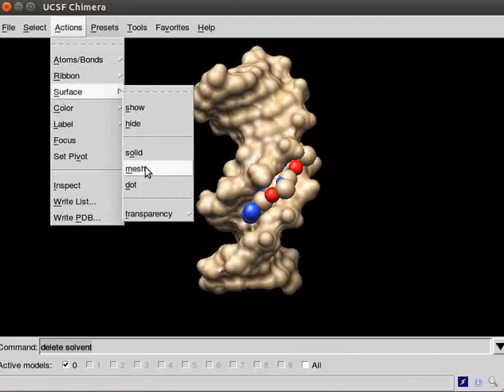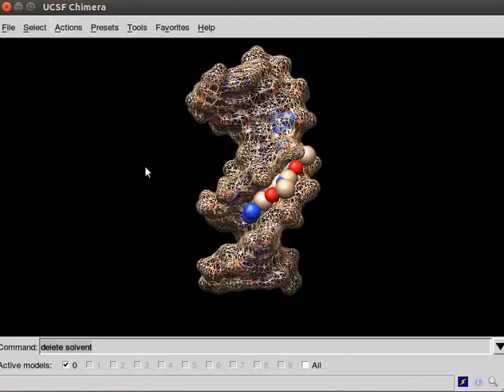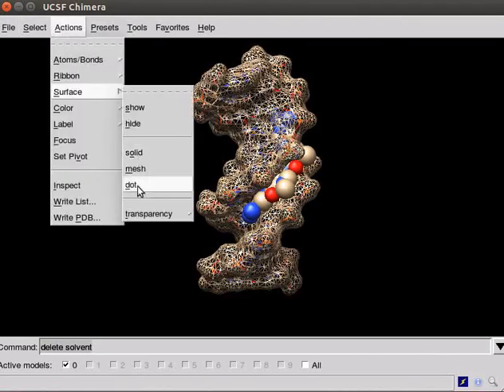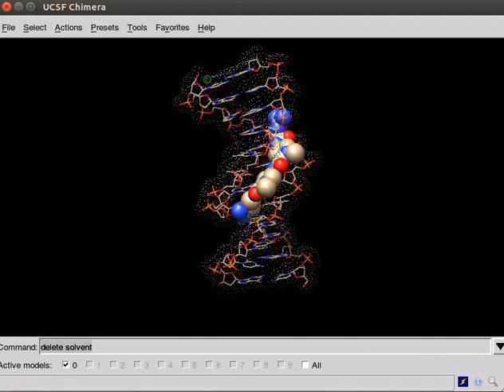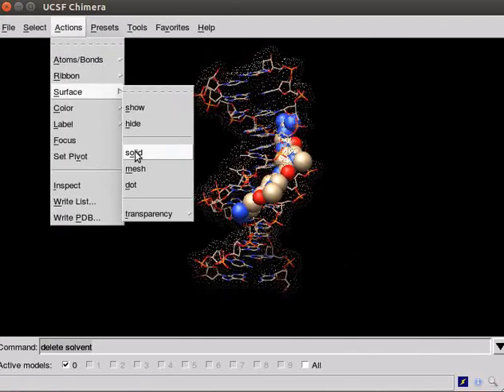Click on Mesh to display mesh surface. Click on Dot to display the dot surface. Click on Solid to get back the solid surface.